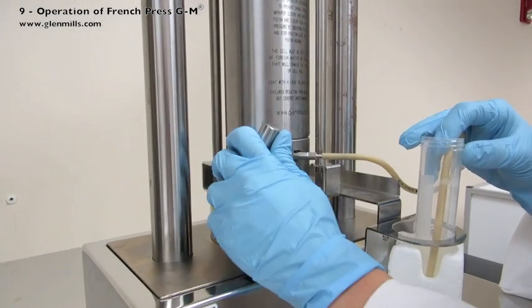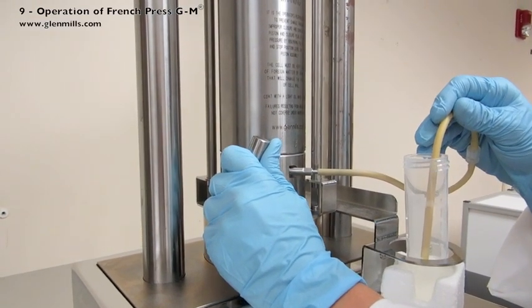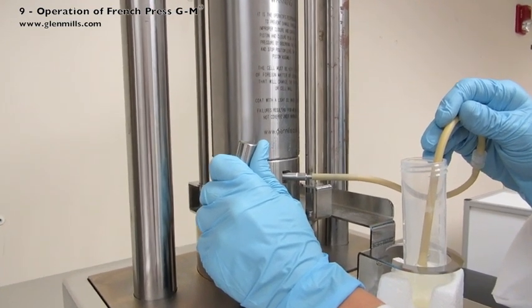Slightly turn the sample valve assembly counter-clockwise to allow the sample to exit the sample outlet tube. Direct the sample dripping out towards the collection beaker.